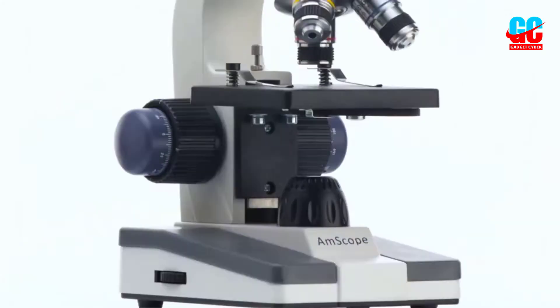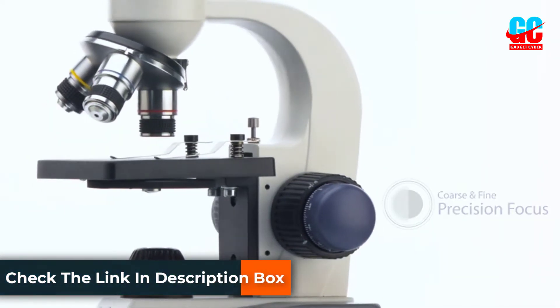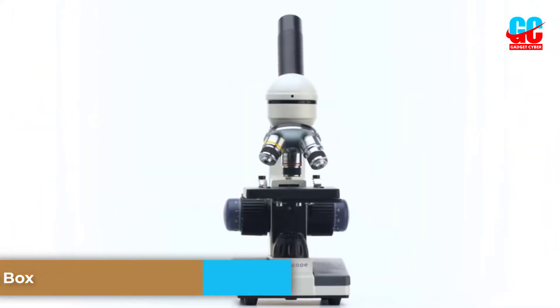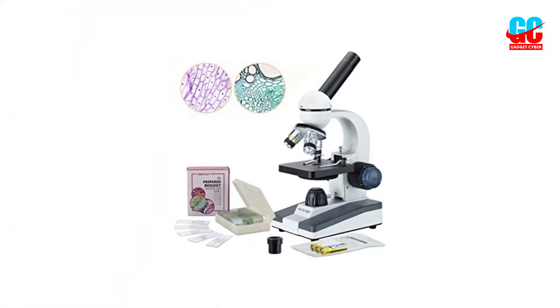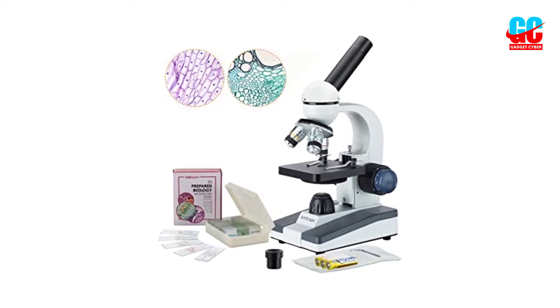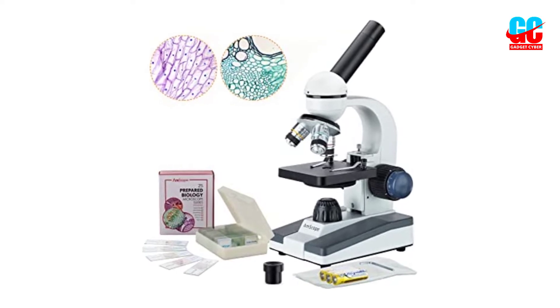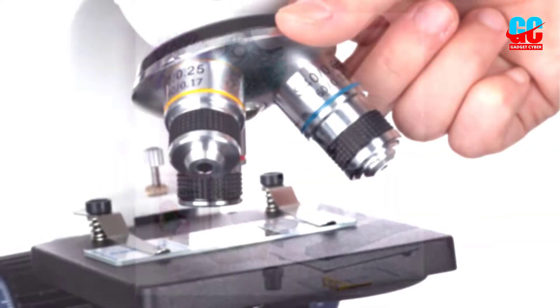Even better, it can be powered by the included wall adapter or three AAA batteries, making it fully portable for field use. We liked the overall feel of this microscope and trusted its rugged construction to last through tough fieldwork conditions with ease. It also focused very easily and quickly thanks to the dual coarse and fine-adjustment focusing knobs.